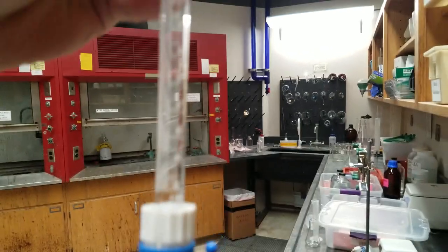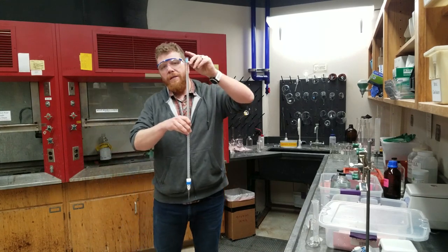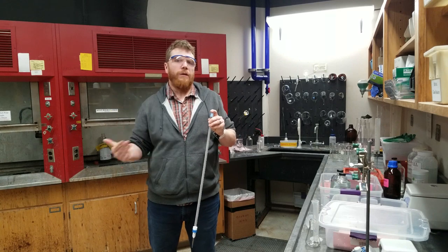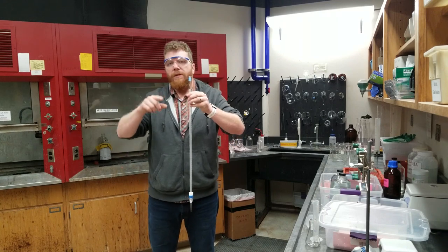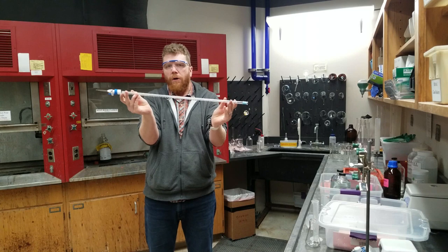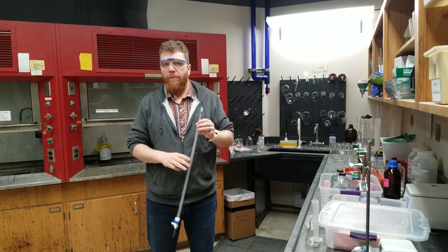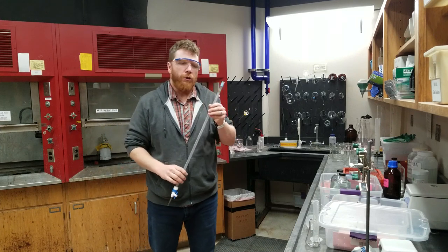What that means is: if you fill this burette all the way to the top, do you have more than 50 milliliters, less than 50, or exactly 50? Well, from the zero marker to the 50 marker is 50 milliliters. If you go beyond that, you're adding more than 50 milliliters, so be careful whenever you're adding your solution.